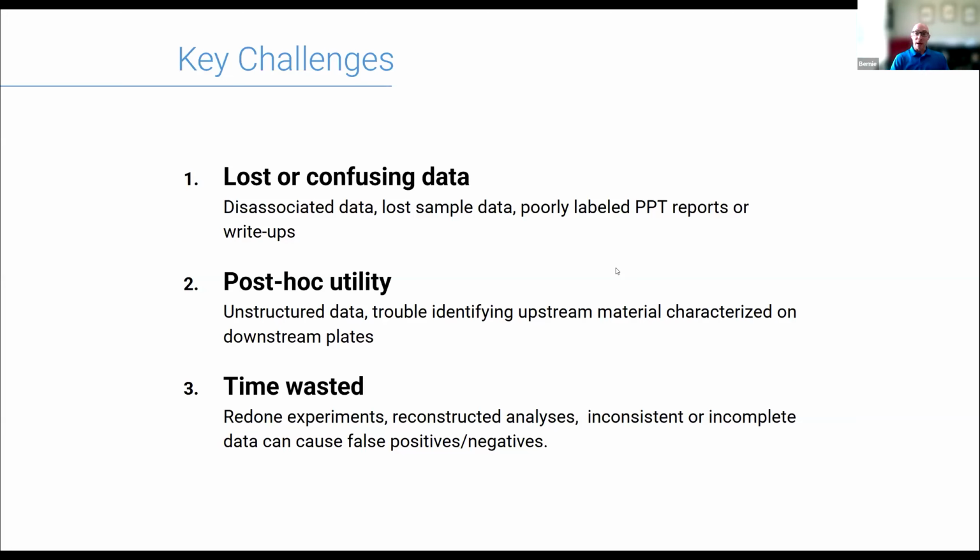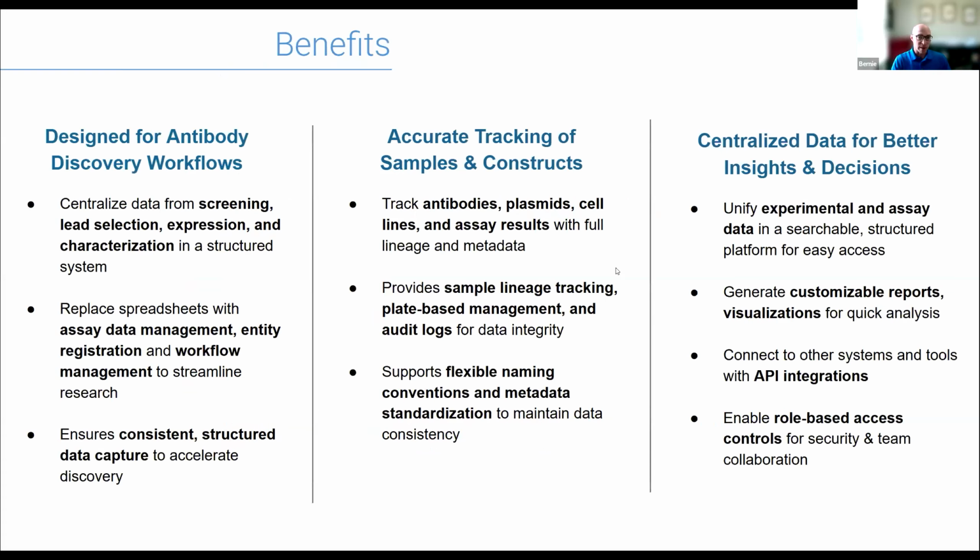time lost when you have to redo experiments or spend a lot of time digging up old data. You have to reconstruct analyses, reconstruct reports, and have lots of meetings with lots of people in order to be sure that you've compiled the right data for whatever the decision is you're trying to make, or whatever the report is you're trying to submit, or for an IND or something like that. And so, by having a centralized system like this, you can better ensure reproducibility across all of this stuff, as well as accessibility. That's probably one of the first benefits that I've listed here.